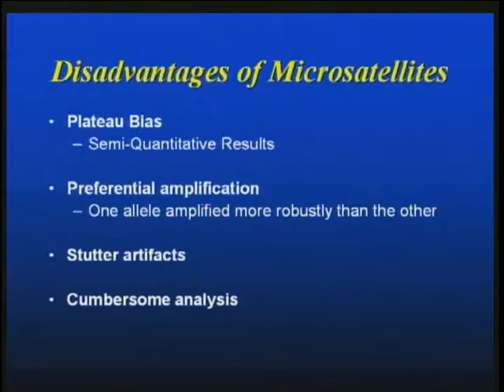Okay, I'll now switch to the real-time PCR, which is this new technology that, as I said, is not yet on the market. It's being beta tested. And virtually all of these slides are from Celera because we don't have any data ourselves to contribute to this. But I'll just introduce you to the technology because, like I said, it does hold some promise in certain areas of engraftment monitoring.